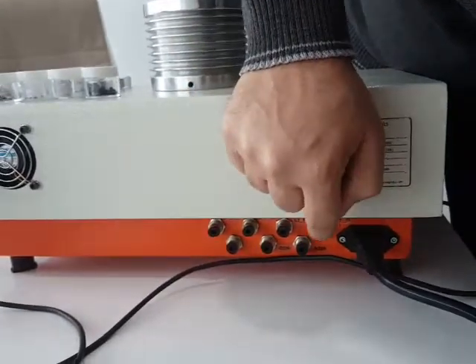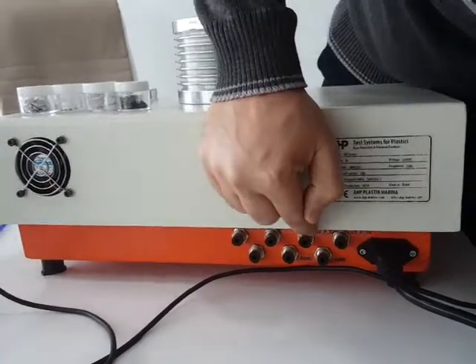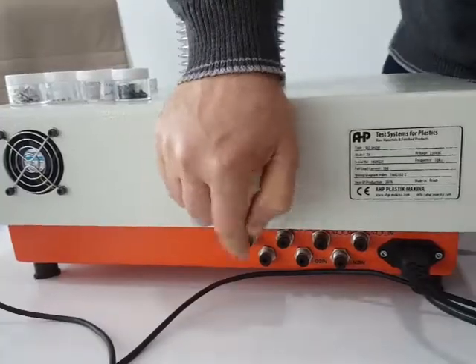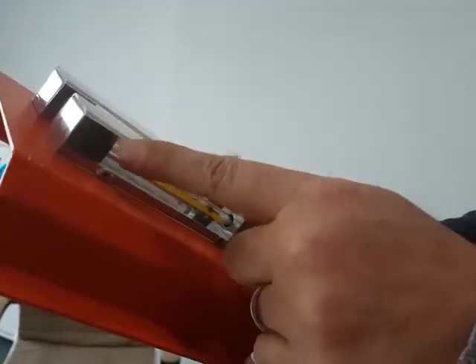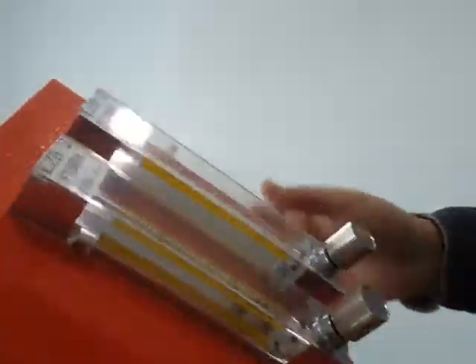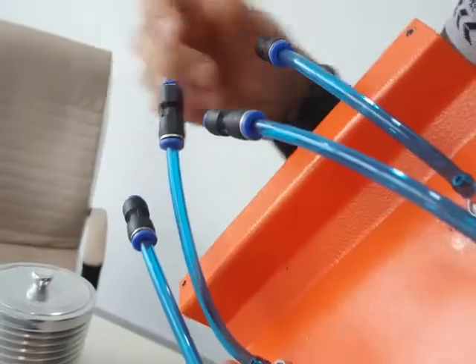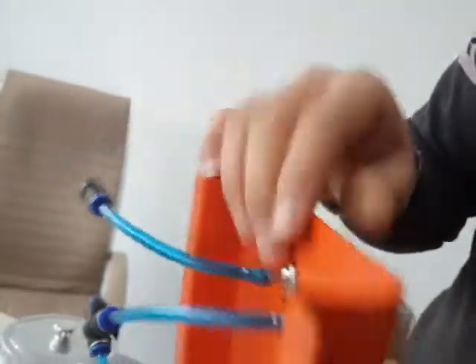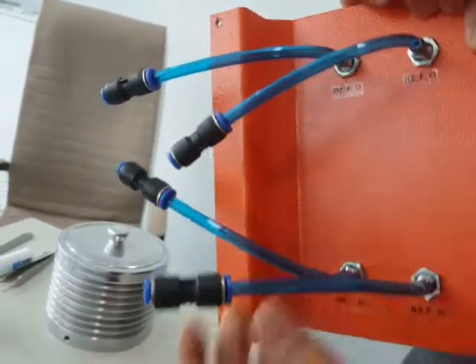The labels indicate flow meter input and flow meter output connections. The downside connection of flow meter one is for nitrogen — the input and output connections are labeled accordingly. For oxygen, the O2 F-in and O2 F-out connections are located on the upper side. All connectors are 4mm air connections.